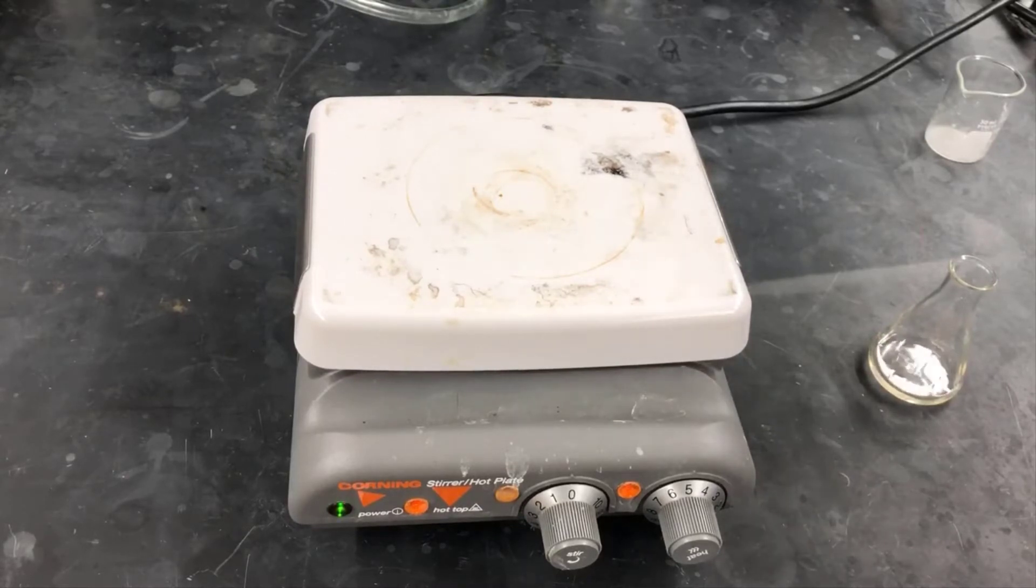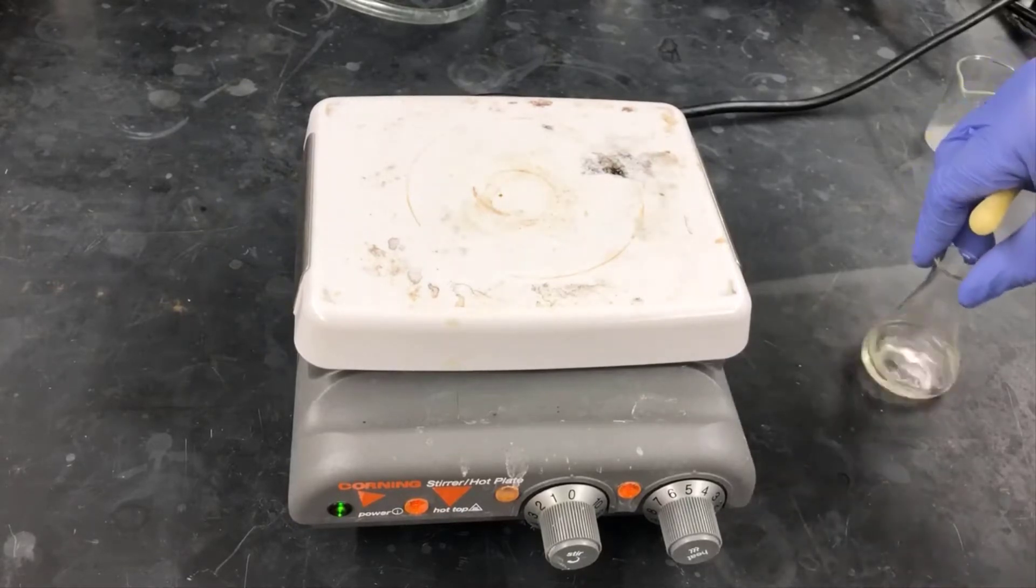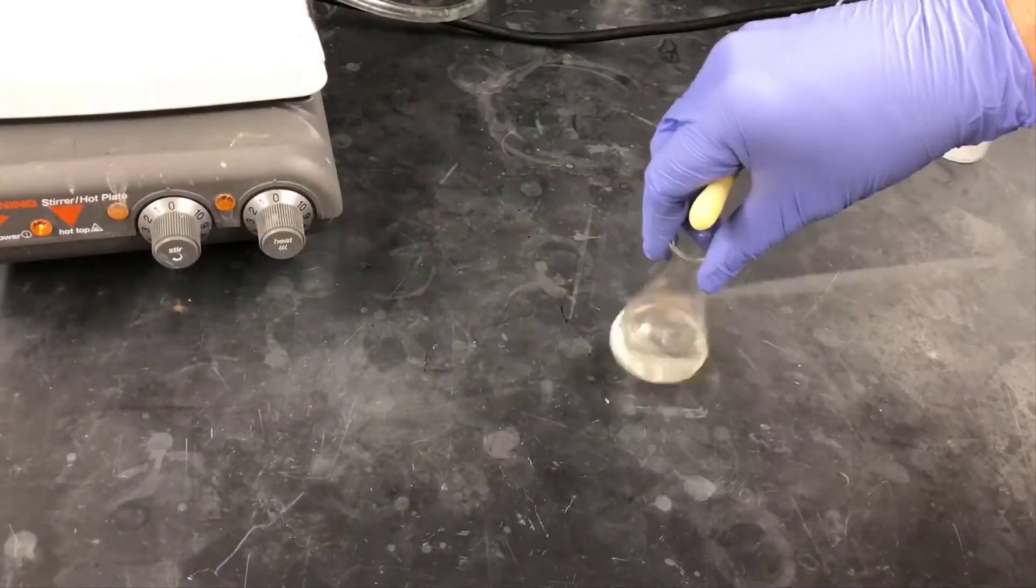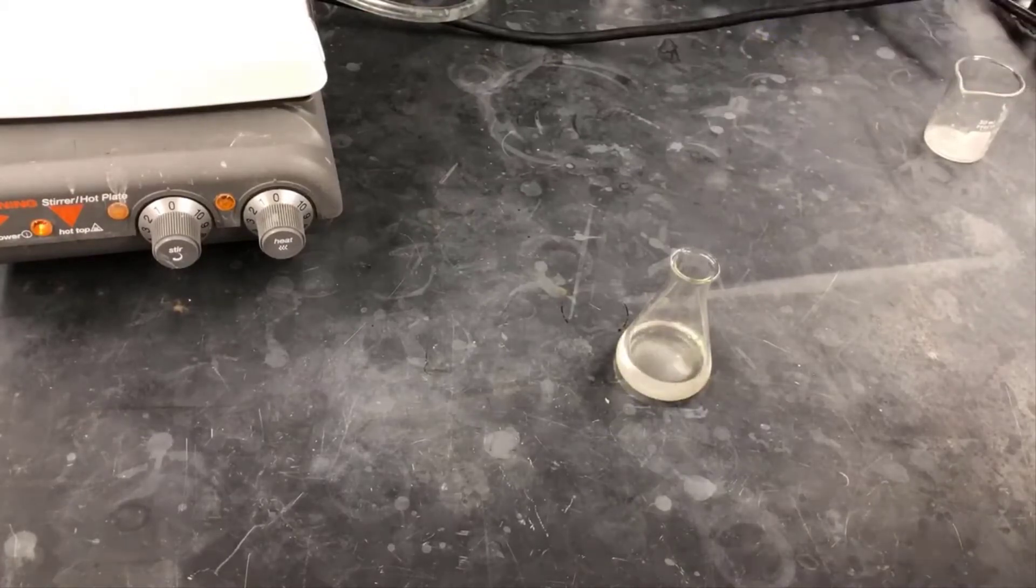Now I'm adding petroleum ether to the solution, one pipetteful at a time, giving it a swirl. I'm looking for the product to start phase separating here. Sometimes that appears as a cloudiness first, and then crystals.